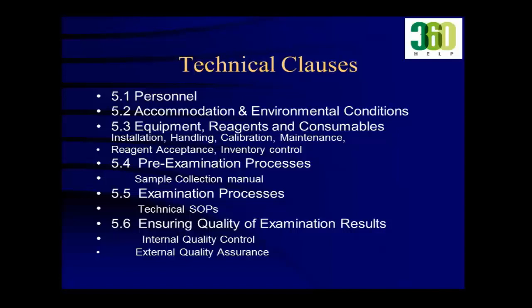Then 5.5 talks about the examination process, where you will write the whole SOP, how the sample is processed in the lab. Once you have received it, now what do you do? You gross it, you make blocks, then you cut blocks, then you make slides. How do you ensure at every step the quality is taken care of? How do you follow the processes? They have to be written.